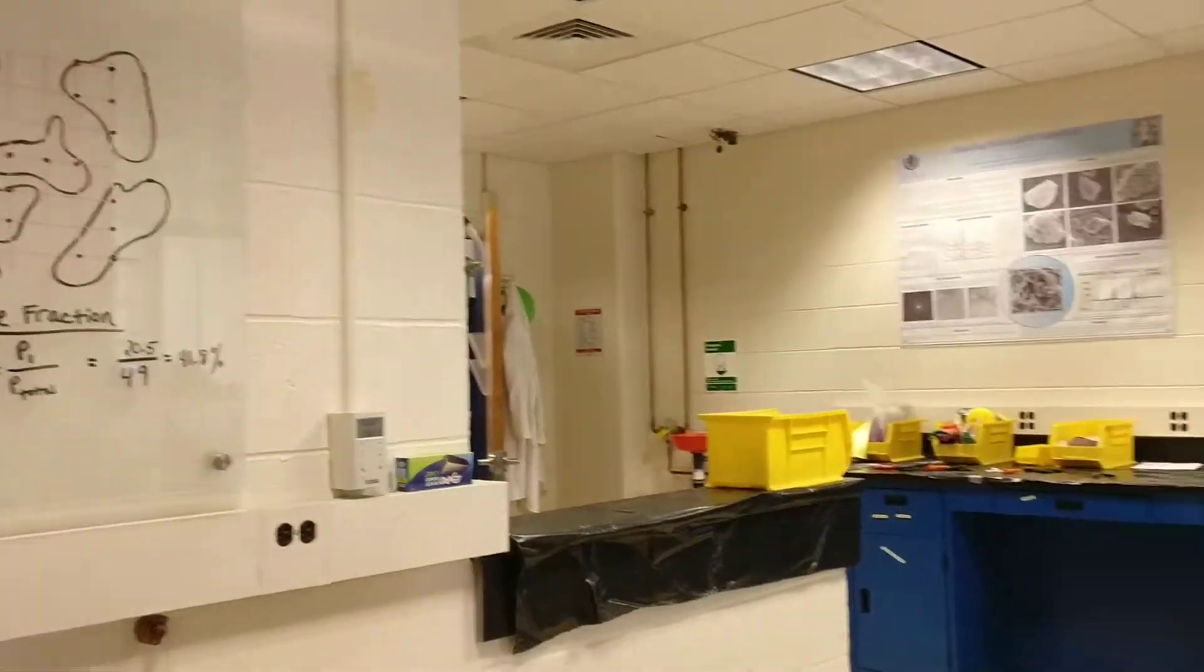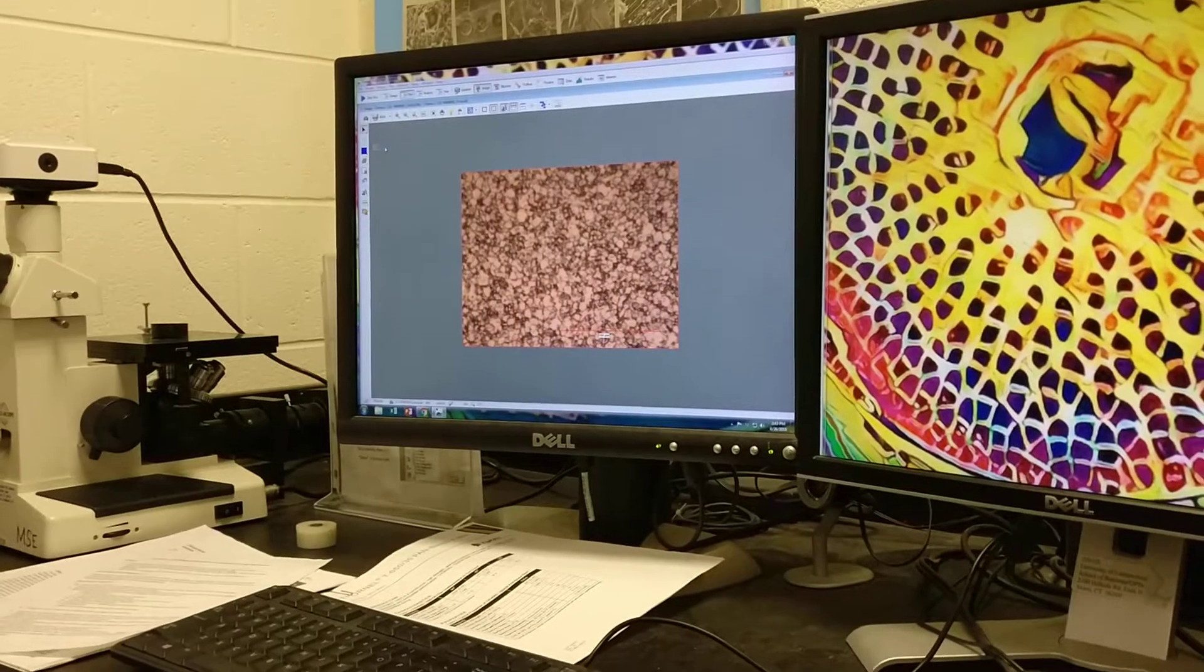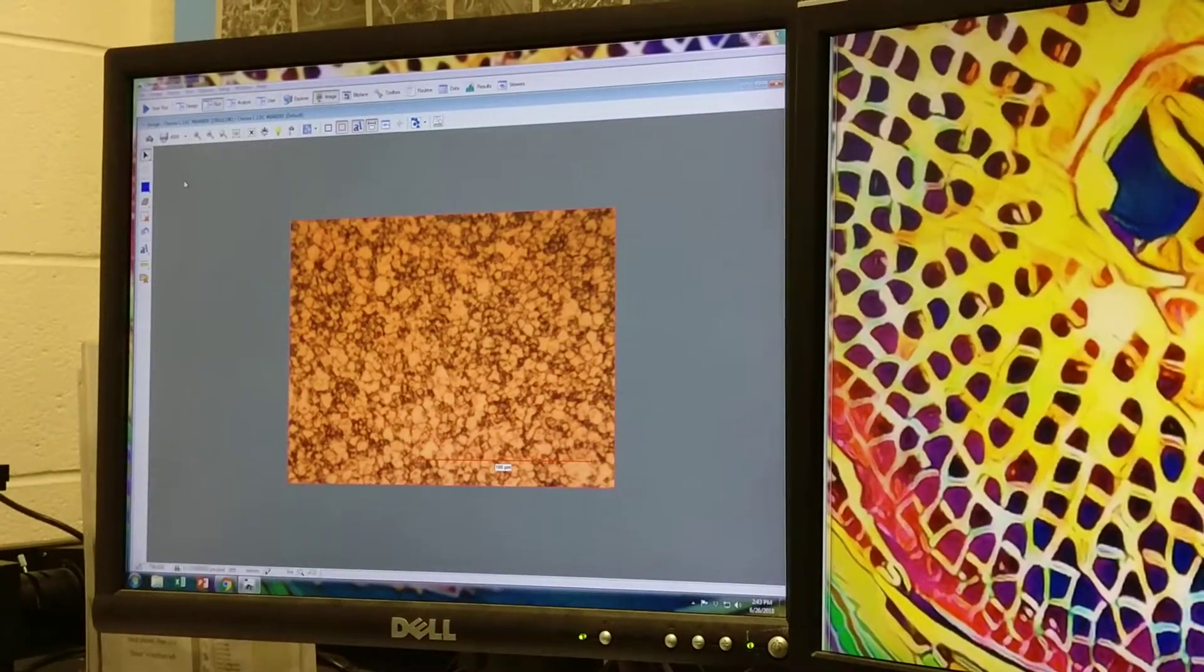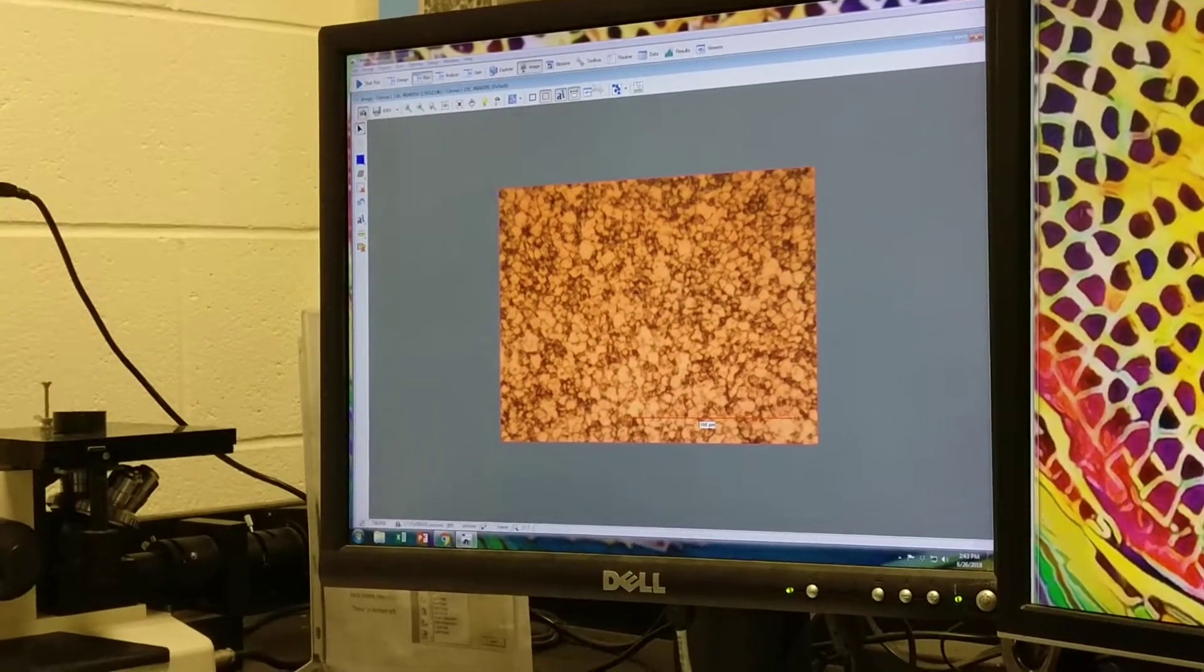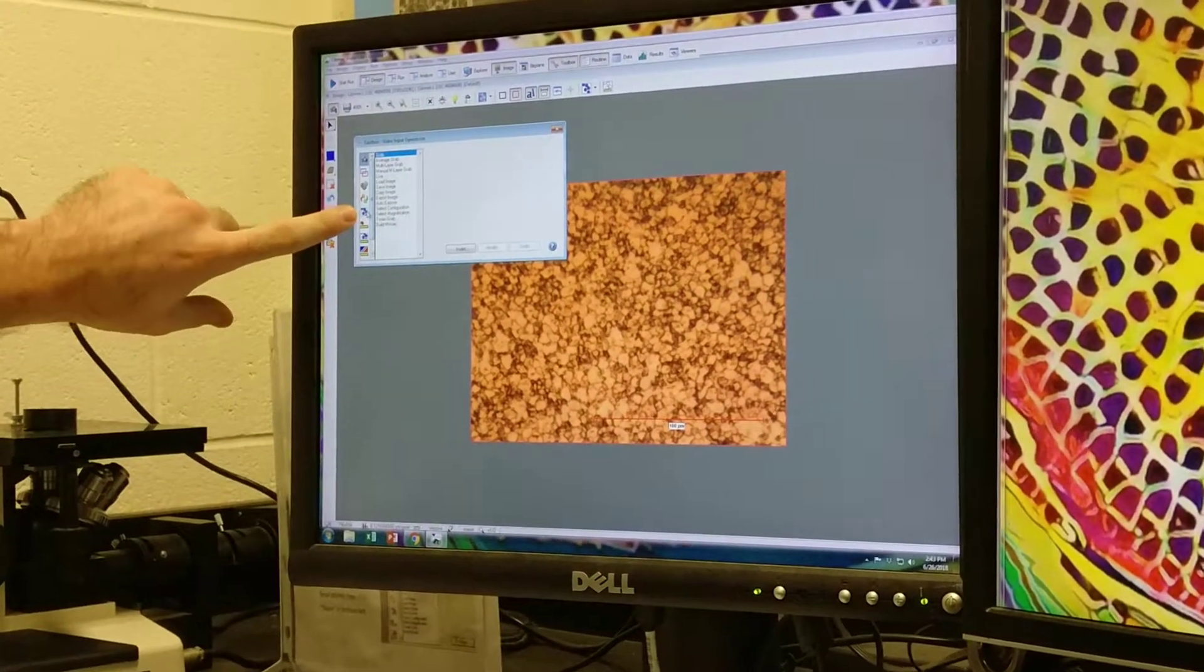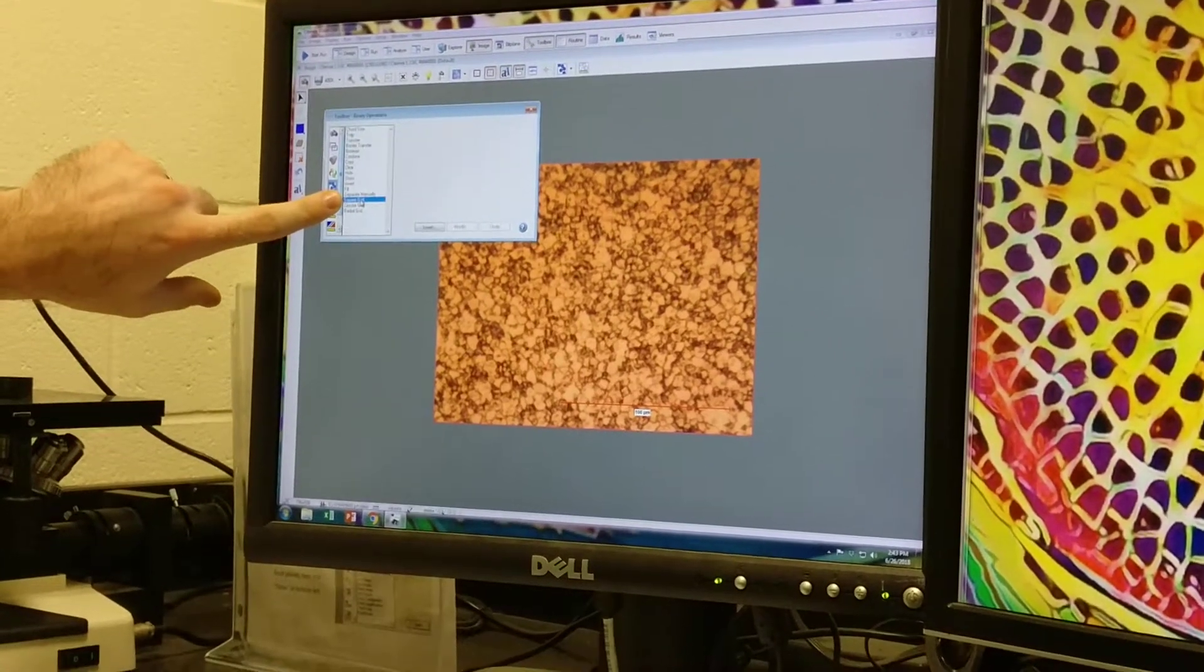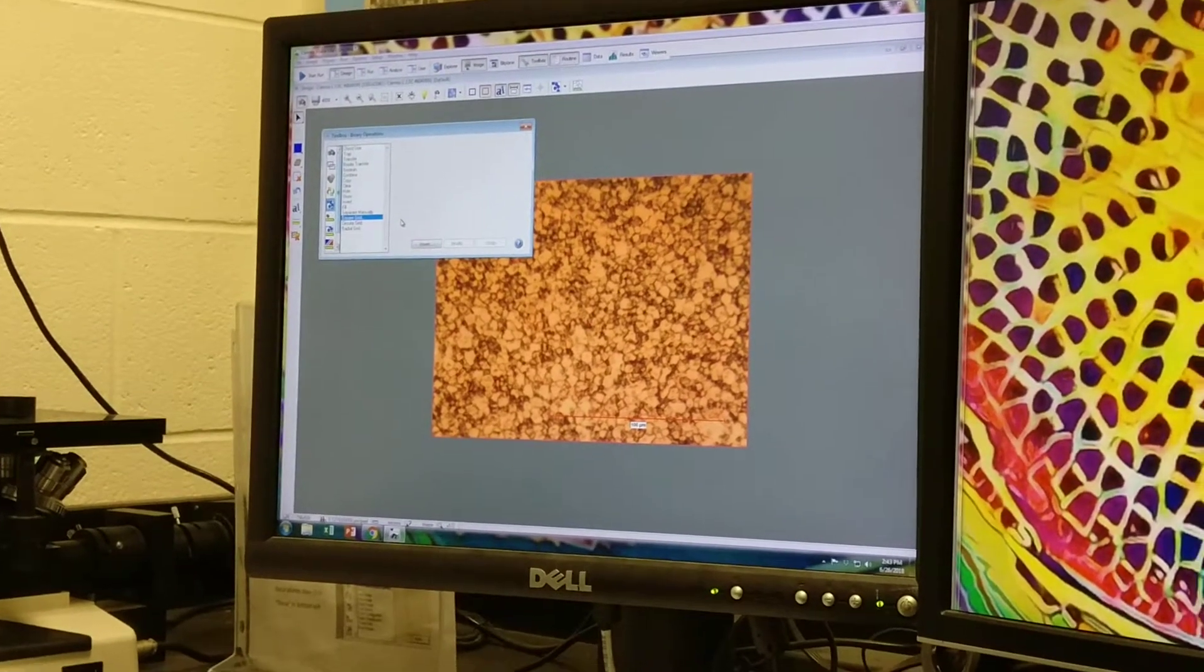I'll show you how to overlay a grid on top of this complex microstructure. First we're going to put it at 400x because it's at 400, get the light and focus correct, freeze the image with this camera icon. We're going to go to this toolbox button and click the fifth icon down. We're going to click square grid and insert.